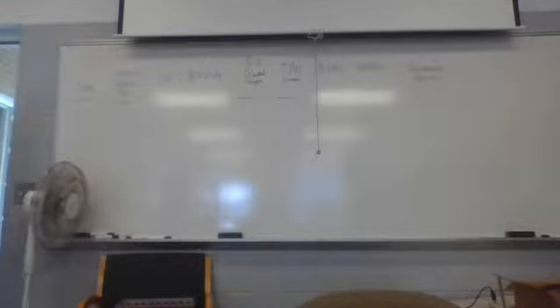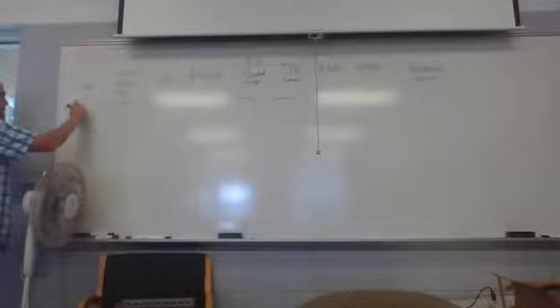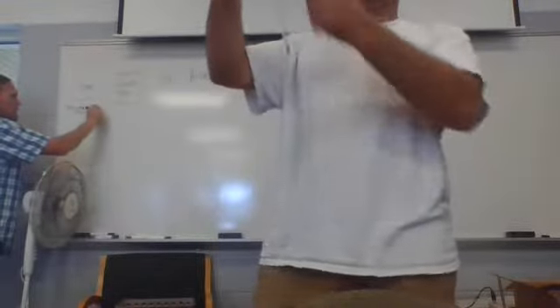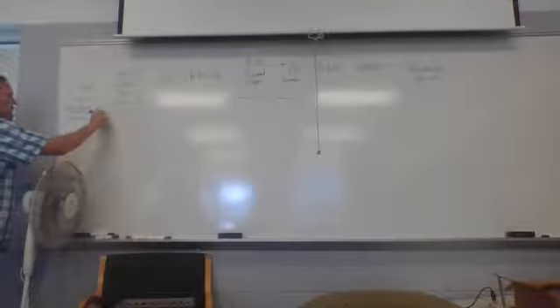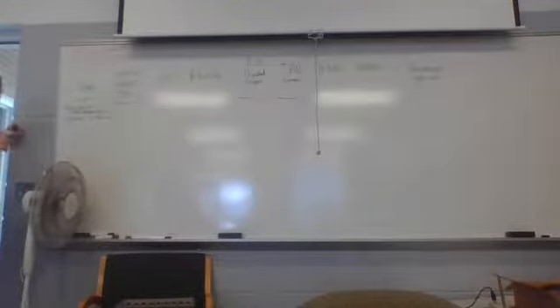So let's go ahead and start from the beginning. How can you measure temperature? Usually you get an alcohol thermometer now, but it used to be mercury. You just put it in there, see how high it goes up, and that's great. But a lot of these other things actually tell you the temperature as well. It's still a thermometer, but what else? It's not necessarily a glass-filled tube.